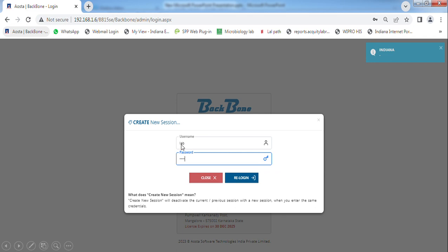So I have entered one of the usernames and passwords which we normally give to the new technicians who have arrived, that is the lab username, and then the password I have entered. It will take at least 15 to 20 days for new technicians to get their username and password. This is to ensure that they are aware of the routine system of our laboratory. So we don't encourage them to enter values and verify values in the hospital information system.